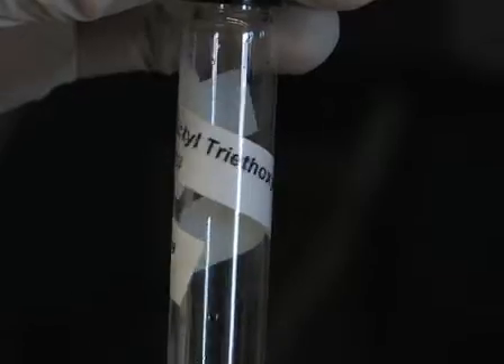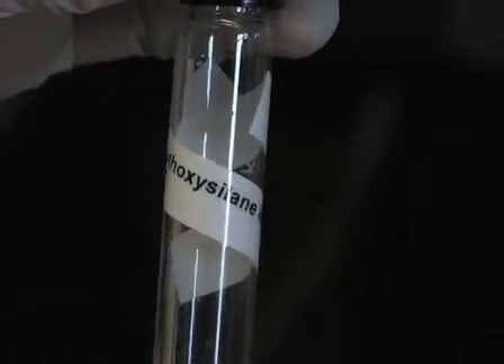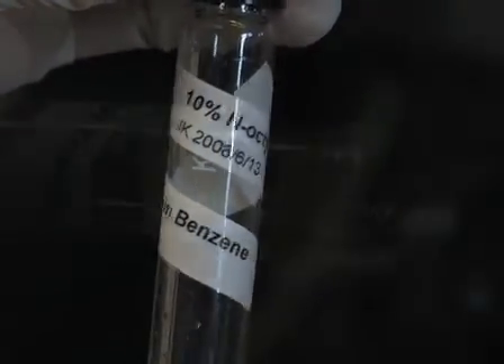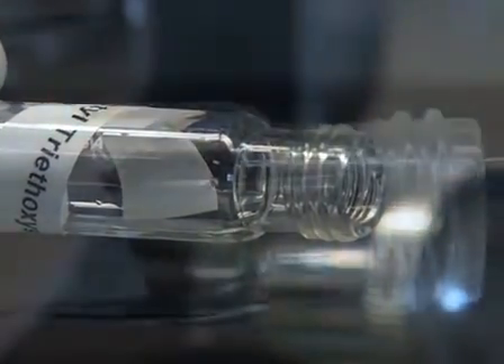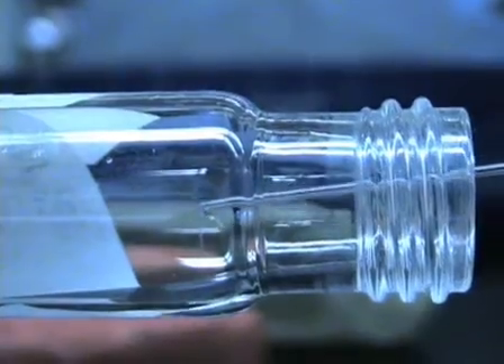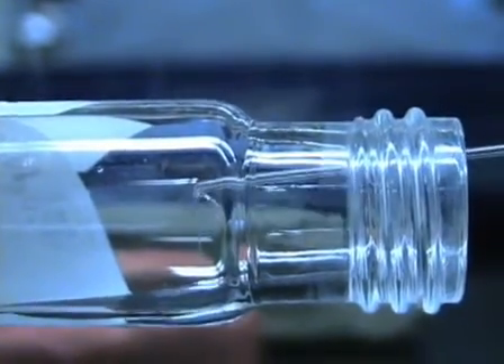Now we silanize the pipette tip with a 10% solution of tri-octyl silane in benzene. This makes the pipette surface hydrophobic so it interacts well with the membrane. Let the solution draw a few millimeters up into the pipette by capillary action. Evaporate the silane using the microforge at low heat and you are done.